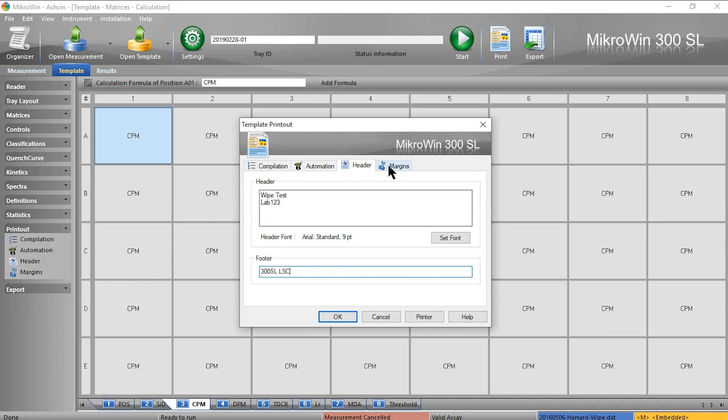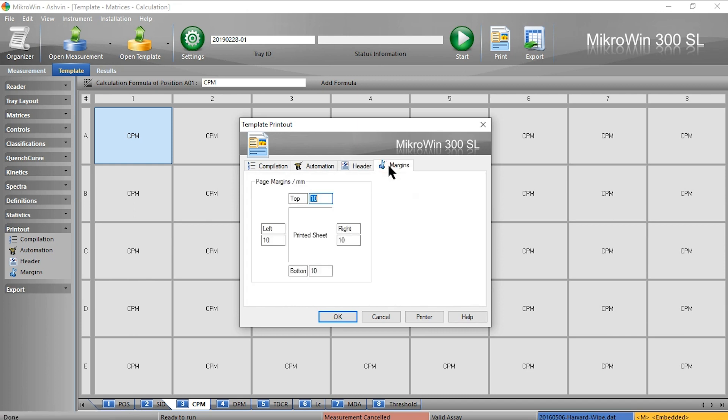If I choose, I can change the margins to fit my printout if I have too much data on the screen.